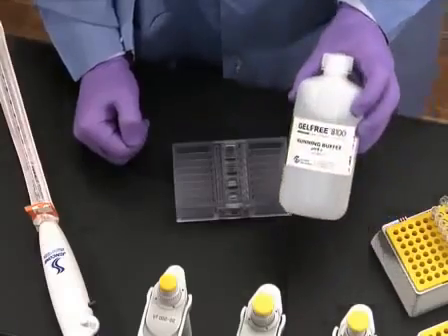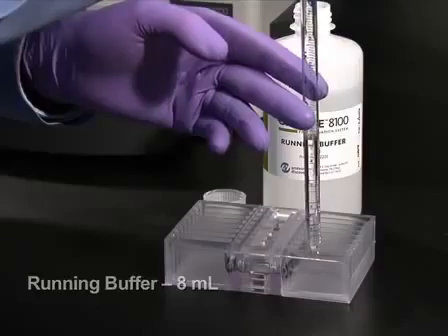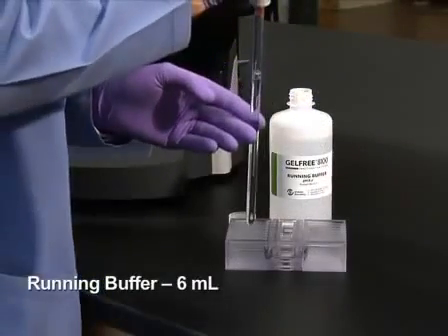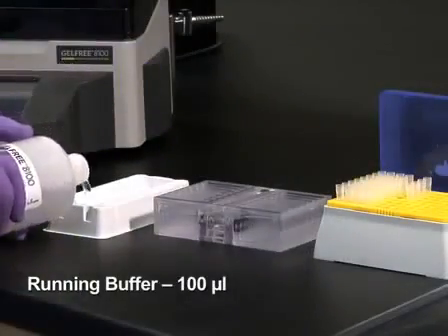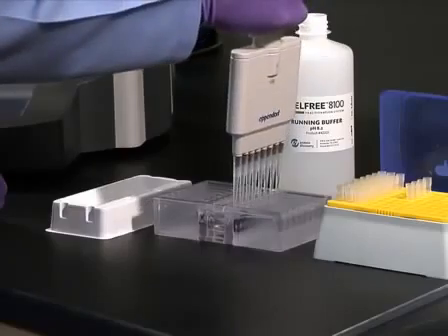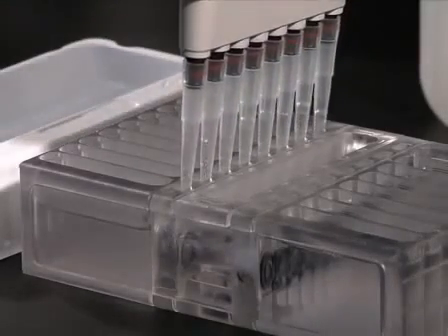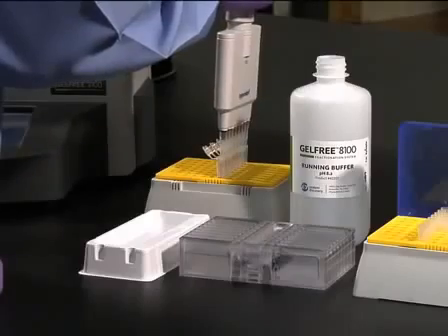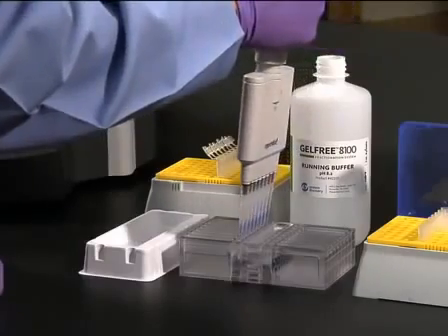Next, 8 milliliters of gel-free running buffer is added to each of the anode buffer reservoirs, 6 milliliters is added to each of the cathode buffer reservoirs, and 100 microliters is pipetted into each of the collection chambers. Using an 8 channel 100 to 200 microliter pipetter, remove and discard any buffer that flowed from the cathode buffer reservoir into the sample loading chamber, and immediately load the samples into the loading chambers.